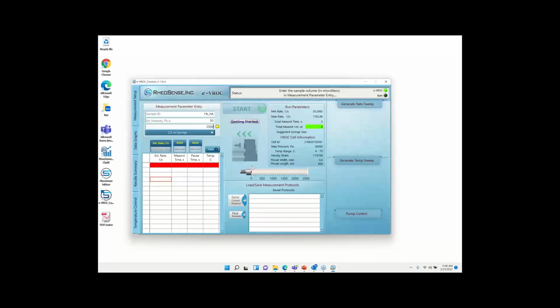I picked the volume I have, and then the volume of fluid that I put into the syringe, so I filled it up. And now, to do what I wanted to do, I need to put in some sort of rate value. Actually, no, this should be empty. That should be all right. So now we can allow the block to find the tip or the end of the piston rod.